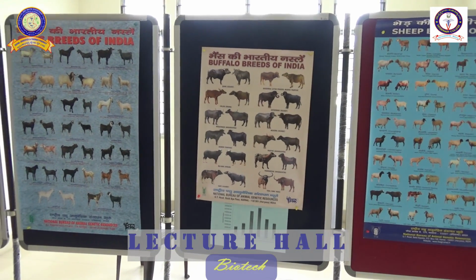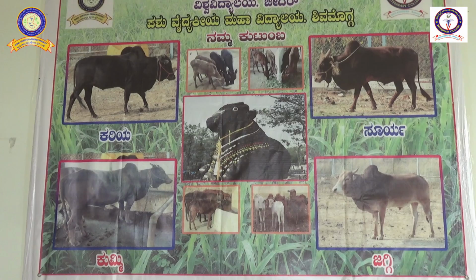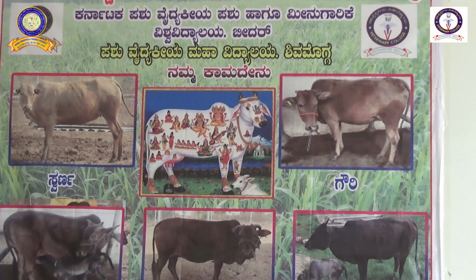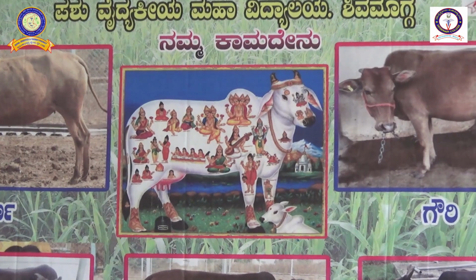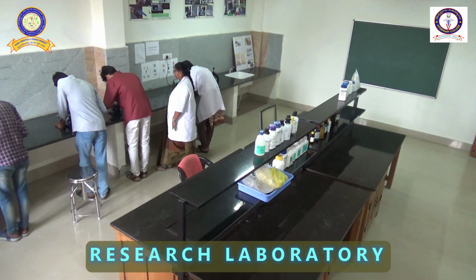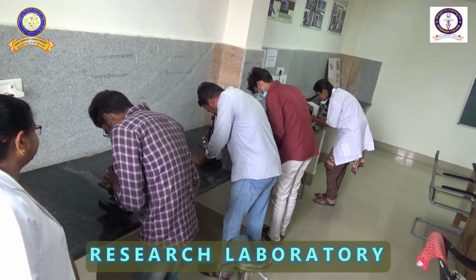Samples of blood or any material are collected to isolate the DNA, and we do vertical and horizontal gel electrophoresis. There is exclusive equipment to demonstrate the polymerase chain reaction, and our lab has an incubator facility to do a culture with the blood, an in vitro lymphocyte culture, to demonstrate the chromosomes of the different species of animals.